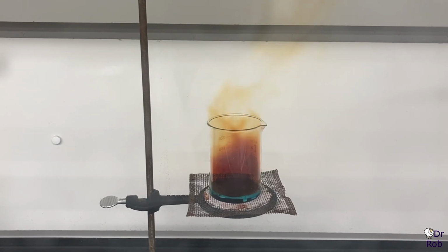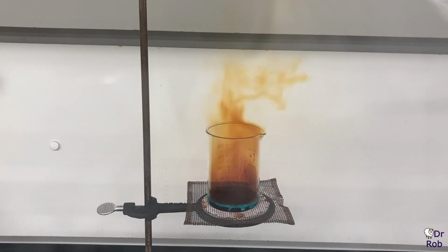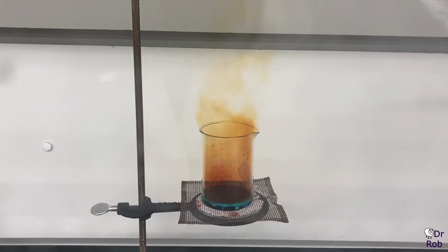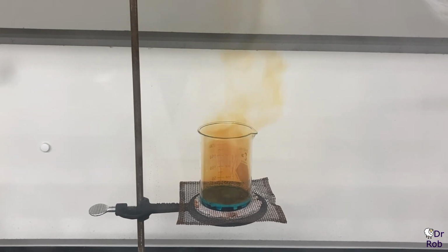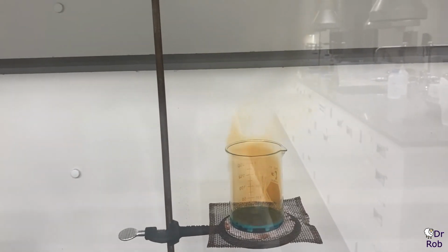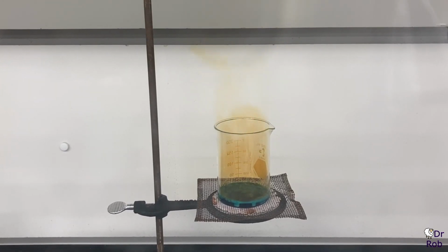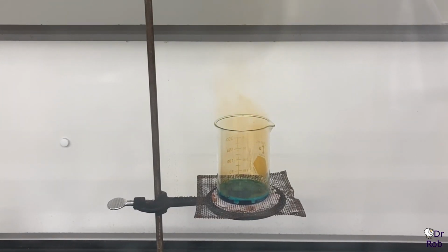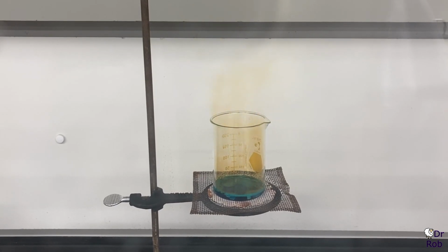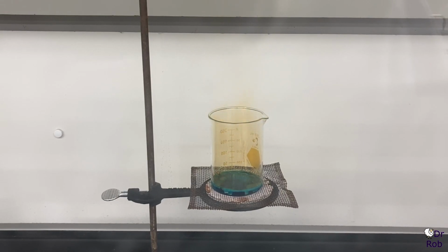So it's much less energetic right now, as there's a lot less solid, but it's still producing a really good amount of the gas. We'll generally consider this reaction complete once there's visually no more gas being formed, although after the first few minutes it tends to get very light brown, and we'll see that here in a bit. But then you're going to want to swirl it around pretty aggressively just to make sure that you're definitely getting all of it. That might not be a completely necessary step.